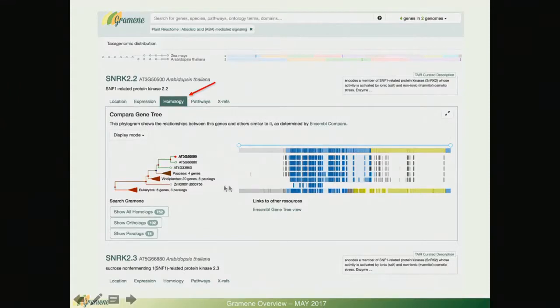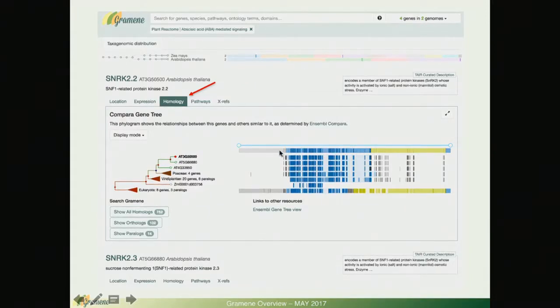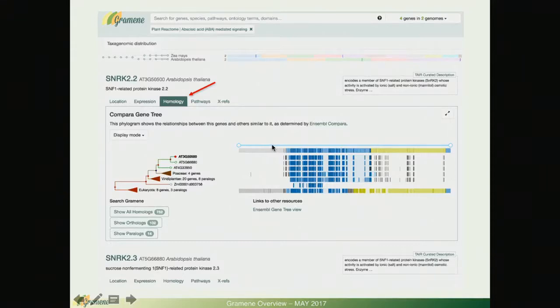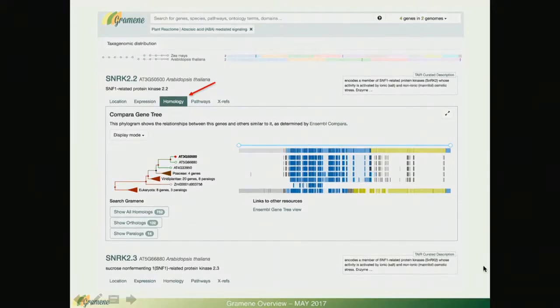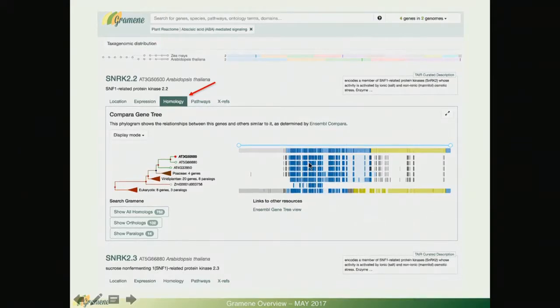What this does is display a comparative gene tree just like the one that you will see at the genome browser except that we offer a few more functionalities. You can see the nodes are collapsed and on the right side there is a visualization of the multiple sequence alignment that are color coded by InterPro domain.